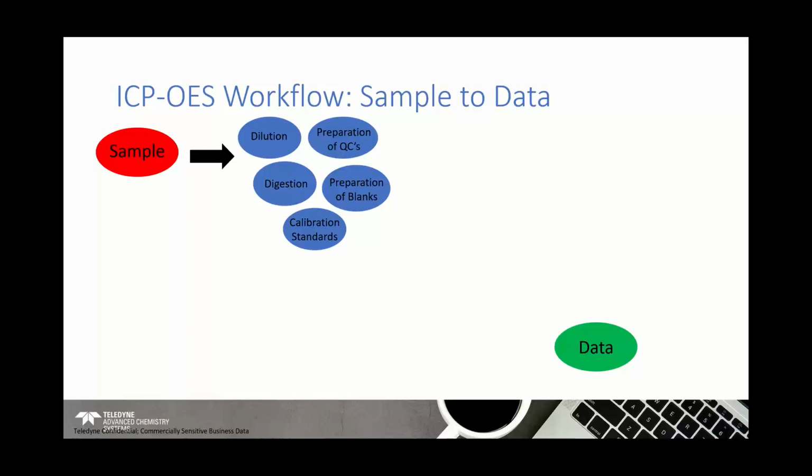So we know what our background level is, our baseline levels from that measurement. And then also we might need to prepare some quality control standards for quality assurance of our analysis generally. So that's where we would start.